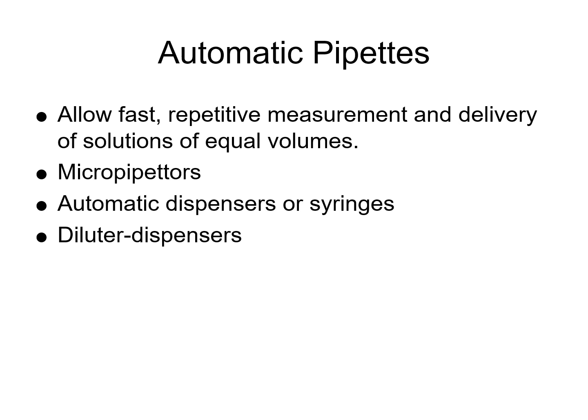So the types of repetitive liquid handling devices, we have micropipettors. These are adjustable or fixed volume pipettes for precise small volume transfers. These are, once again, ideal for ELISA, immunoassays, or other microvolume applications, and can deliver multiple aliquots quickly and consistently.